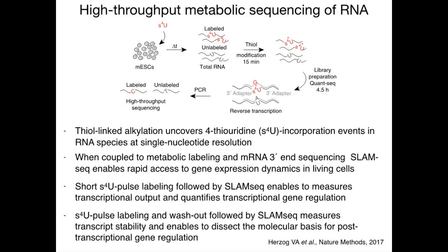On the biological side, I've shown you some of the applications of SLAM-seq. On the one side, I've shown you that short 4-thiouridine pulse labeling followed by SLAM-seq enables us to measure functional processed RNA-polymerase-II-directed transcriptional output and quantifies transcriptional gene regulation, as confirmed by mechanistic studies on enhancer function in mouse embryonic stem cells.